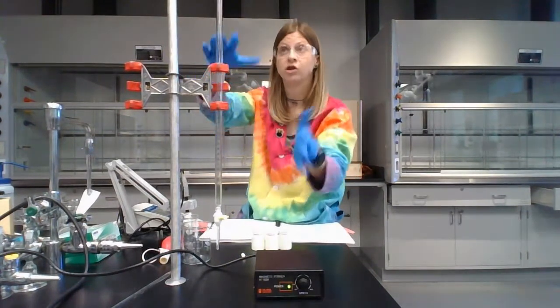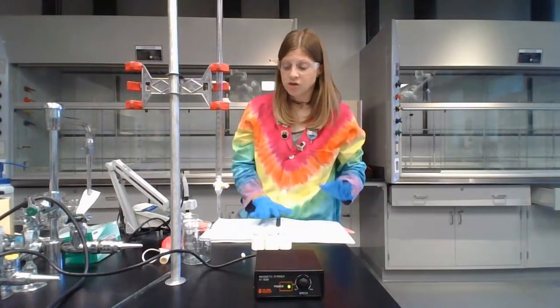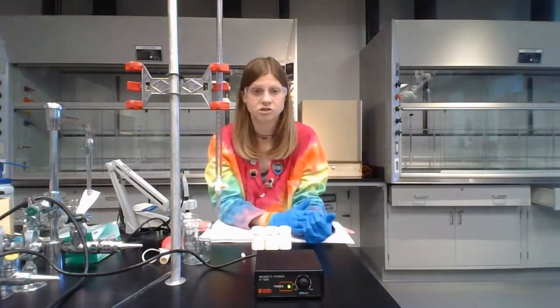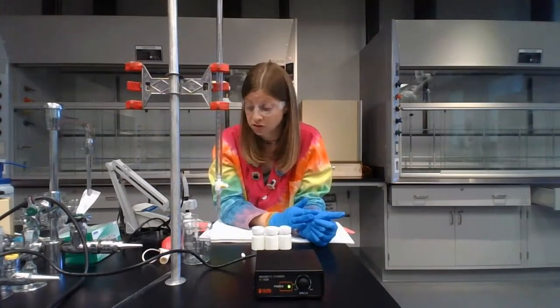Okay. So you will have loaded your burette with the sodium hydroxide after you conditioned it. The solution that we're testing the sodium hydroxide against is an unknown weak acid. You will be given your unknown weak acid. It will have an unknown number. Make sure you record that.